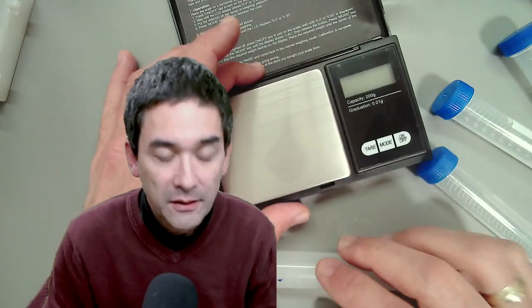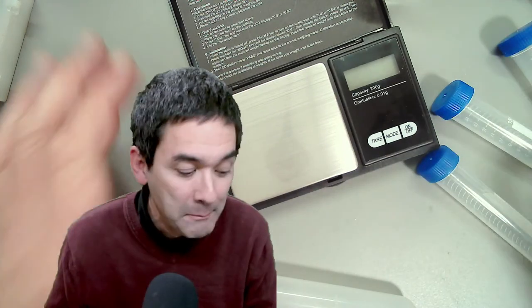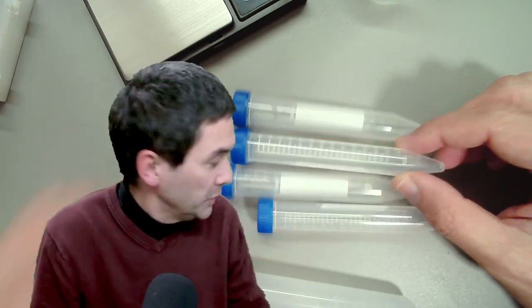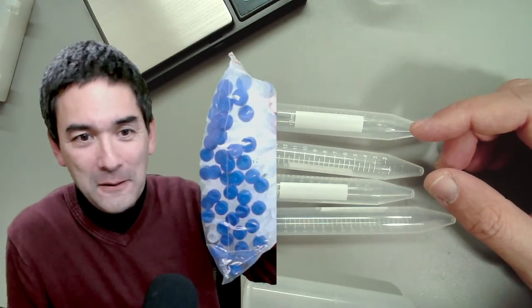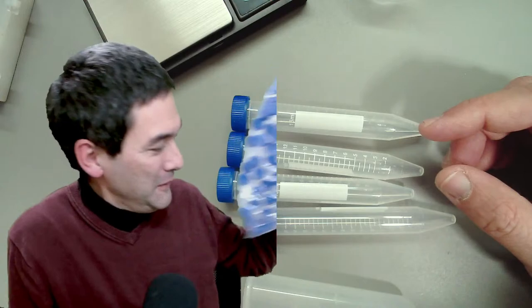I'm going to show you my desk. We need a precision scale because when we centrifuge the samples — when we spin them — they have to be balanced. Over here I have some centrifugation tubes. These are disposable tubes that I'll be using to separate and concentrate the sample. I bought this bag just recently — there are a hundred of them. They have 15 milliliters, though the smaller 10 milliliter ones also work.